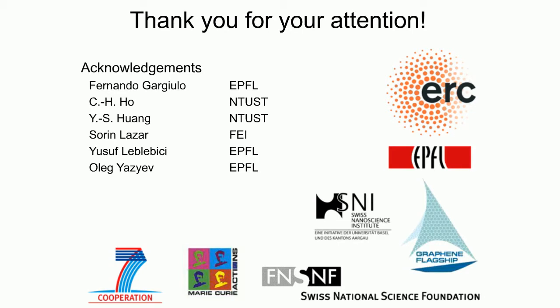But I want to point something out, and that is that there can be secondary effects, because if you remember the paper that I talked about from Beaton's group, and I apologize, that was done in tapping mode. I had it in the wrong order. It looked like that was done in lateral mode, but that was actually in tapping mode.